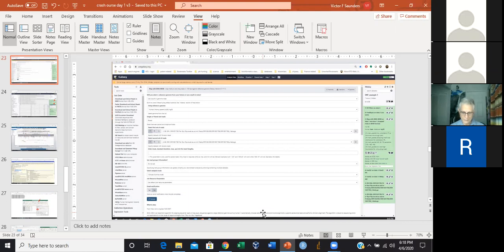So you're looking at any given point along the genome, and you want to know how confident the sequence you're looking at is. You say, how many times do I have a read that overlaps it? And that's depth.